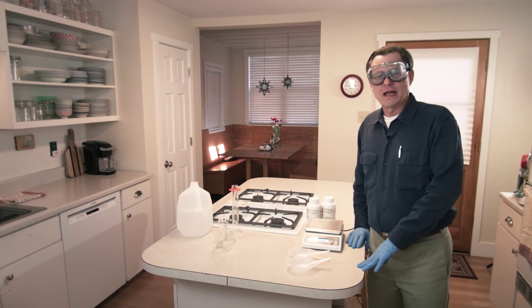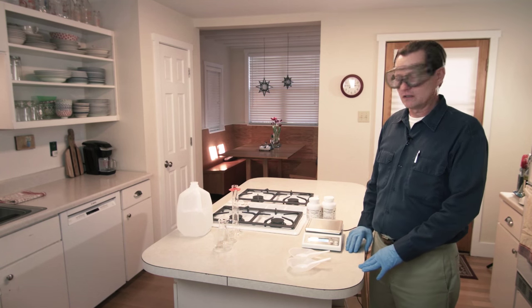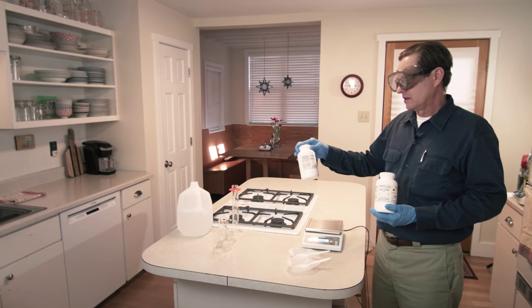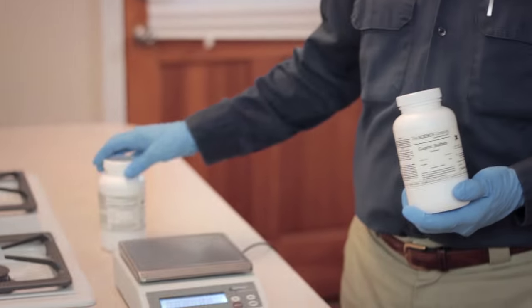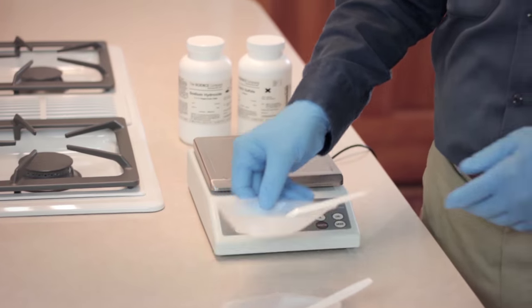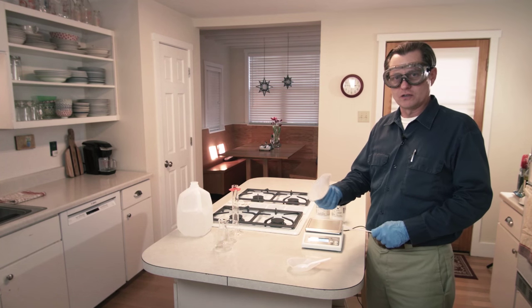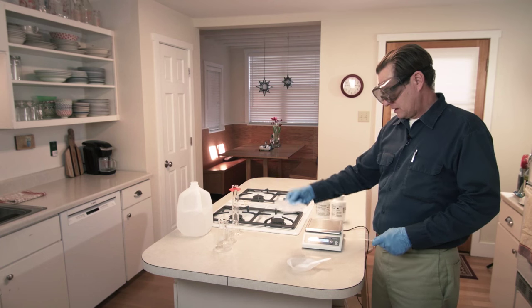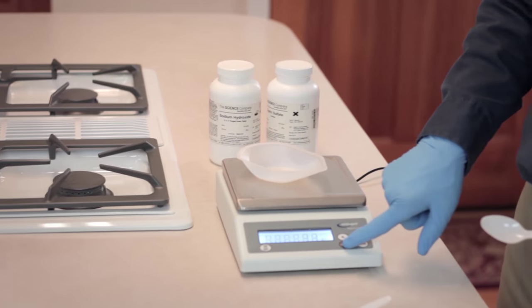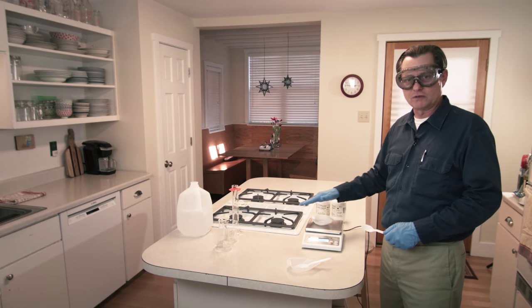Our first reaction in the sequence of six is to make two solutions: one copper sulfate solution and one solution of sodium hydroxide. I have a mass balance here and two weighing dishes for measuring out the weights of these chemicals, and some plastic spoons for mixing. If you don't have weighing dishes, you can use coffee filters. I'm going to put a weighing dish on the balance and zero it, so I can just read off the mass I need.